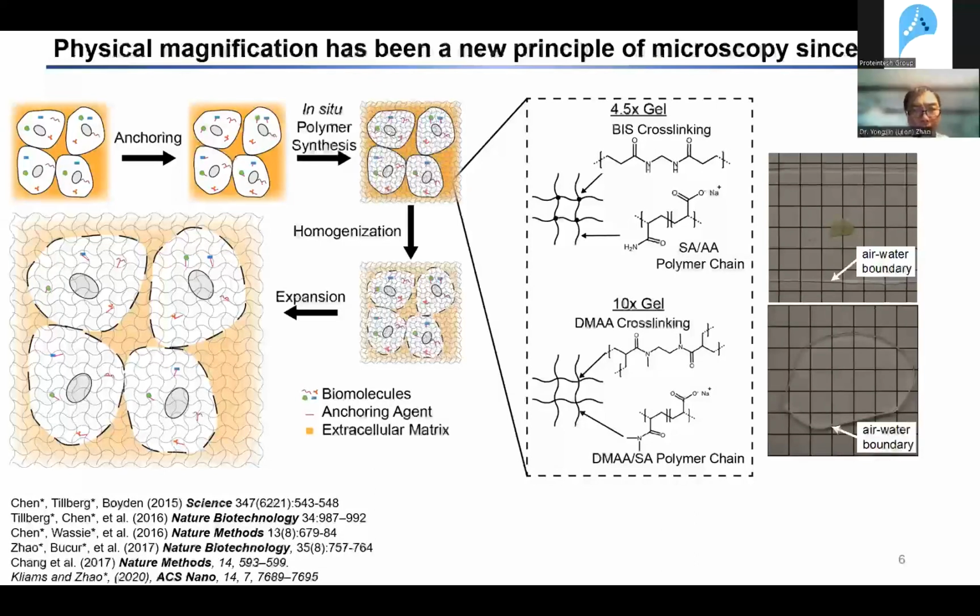And then the spatial location, remember those targeted biomolecules actually covalently link to the network. The hydrogel network can serve as a coordinate, a 3D coordinate. Therefore, if you add pure water, this hydrogel will actually swell, expand homogeneously in 3 dimensions because there's no structural protein getting in the way. And the biomolecule that decorates the hydrogel will also isotropically separate from each other, while still maintaining the overall shape and structure that way. So therefore, you will get this expanded sample.